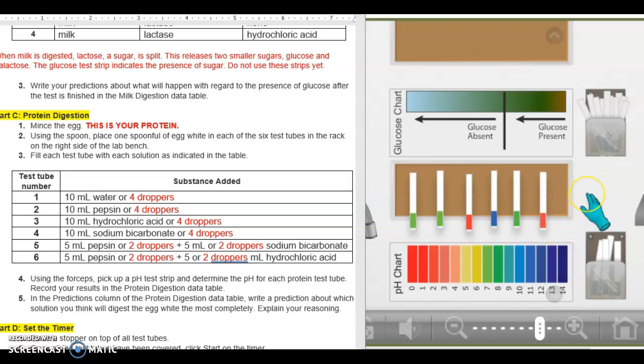Bleach, they don't suggest that you play with that too much, but if you did, it feels slippery between your fingers. So your stomach solution is an acid. It falls in the range of 1 to 2 on the pH chart. Water is neutral, and that's a good thing. You want to be able to drink it without having any complications in your body. So it's neutral on the pH scale. And then the blues obviously are your basic ranges. So when we tested the first test tube, we shouldn't be surprised that it's just water, and nothing has dissolved yet. So that should be a 7.